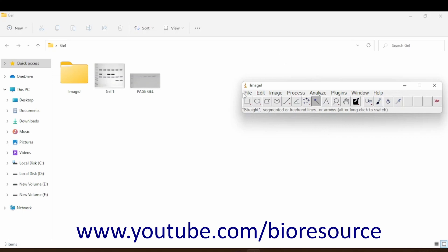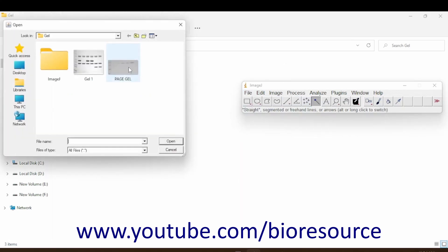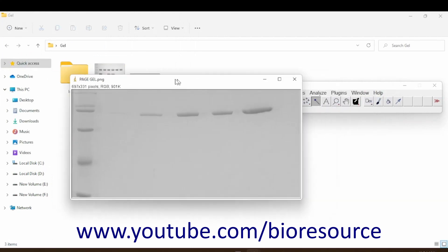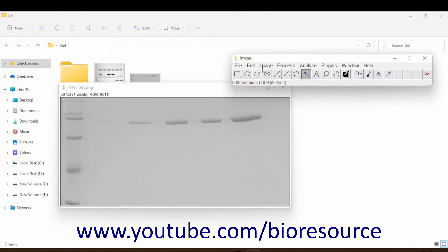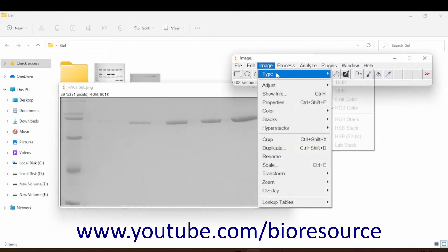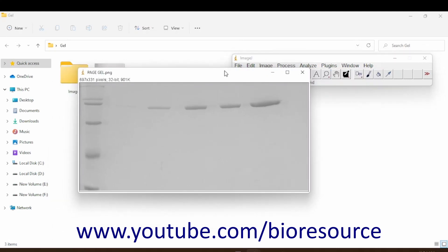I have ImageJ opened here. Go to File and open the gel image you want to analyze. Then go to Image > Type and convert it to 32-bit. As you can see here, there are five bands, and the first one is the control band — the protein concentration of that particular band is known.